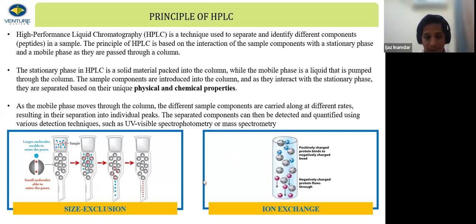So, does that mean that any chromatography can be coupled with a mass spec? Theoretically, yes, but there is a compatibility issue. The mobile phase that you are using should be compatible with the LCMS part. Very briefly, you are discouraged from using any mobile phase that is non-volatile. You should use mobile phases that are volatile. The reason we'll look at in the next couple of slides. So yes, you can couple size exclusion to a mass spec, provided that your mobile phase is compatible with mass spec. One of the criteria for checking compatibility is that it should be volatile.